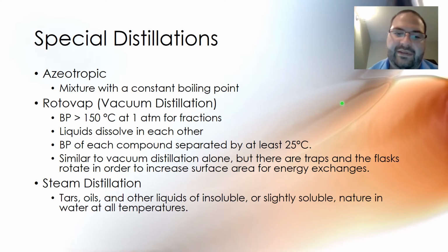So you want to try to conserve that energy, especially if you're trying to use something like a steam bath to get something off. You'd have to apply some vacuum, because as you no doubt remember, steam baths generally only give you about 100 to 120 degrees Celsius maximum temperature that you can achieve, and you have to keep it pretty close to the heat source in order to maintain that, because there's not a lot of insulation between the air and the steam bath itself.